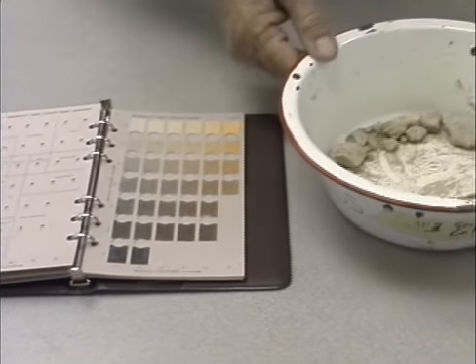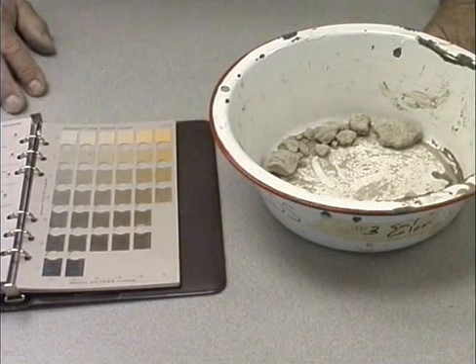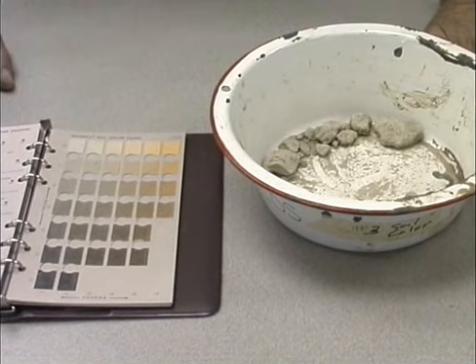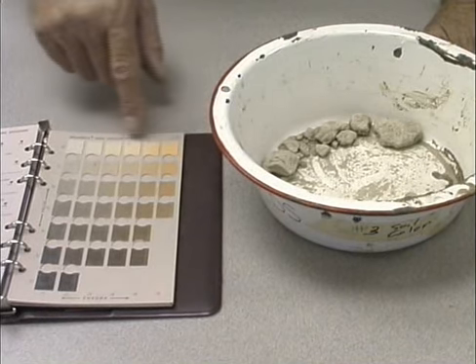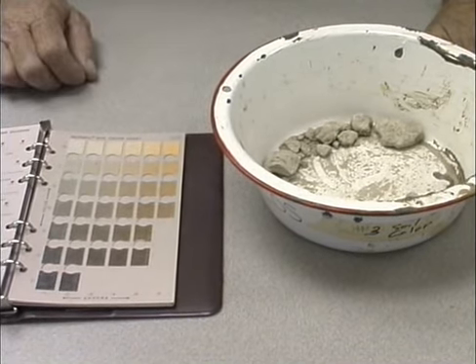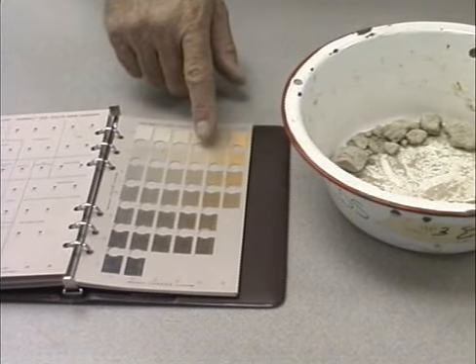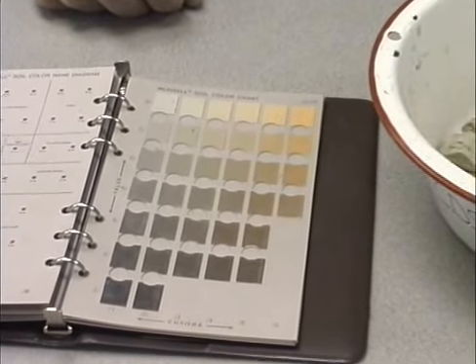Soil sample number 3 is the one that we did texture on. It's the last example. It's the one that had quite a bit of accumulated lime in it. Now, if we look back on our chart of the same range here, we see that as we go up the chart, or increase in value, we do have quite a bit more of this whitish gray occurring in those particular samples.